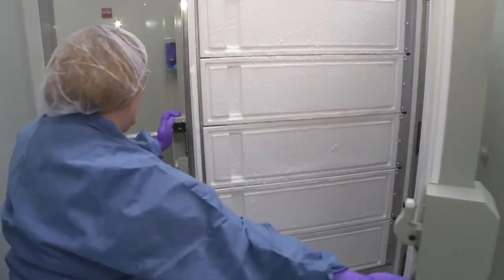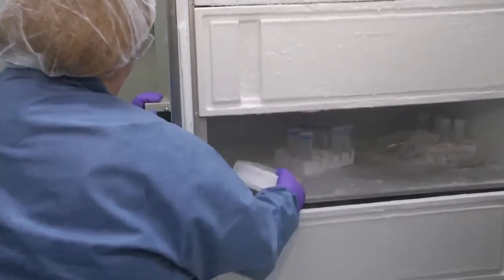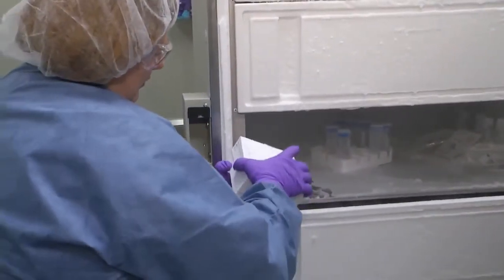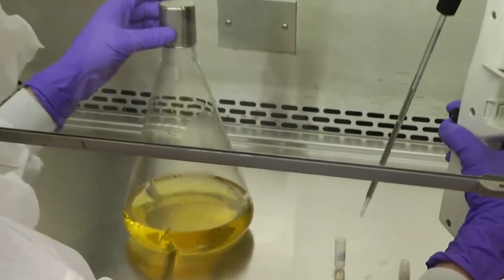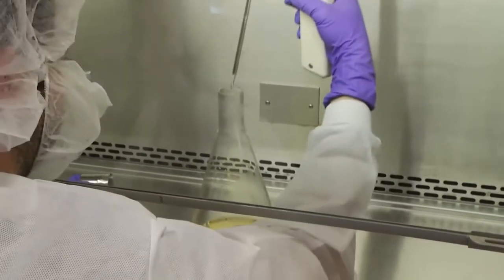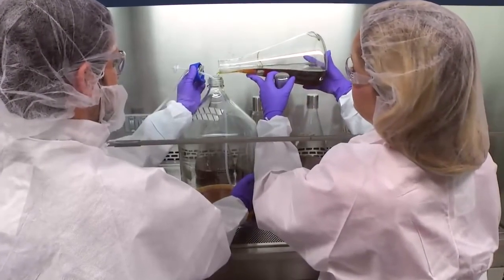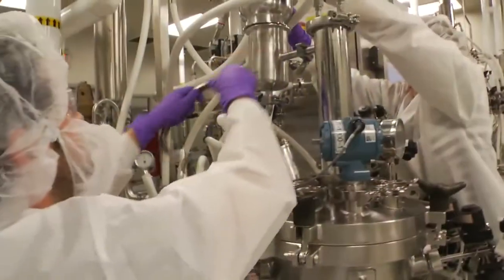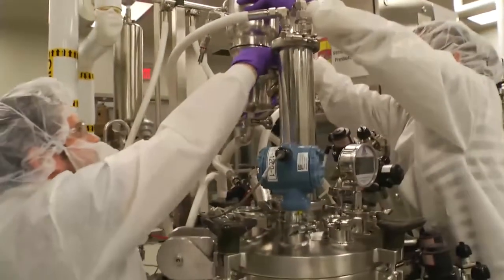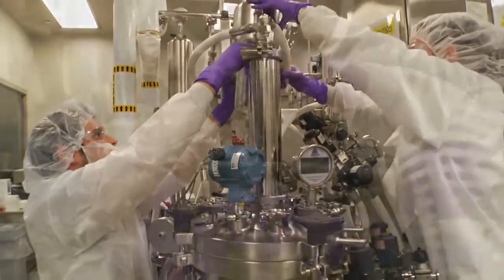The GFP fermentation process really begins with the expansion of our bacteria seed stock. After removing the specially modified E. coli from the freezer and thawing it, it's used to inoculate a small amount of fresh media in a shaker flask. After the number of cells has reached the target amount, the thriving cells are ready for fermentation. Meanwhile, in the fermentation area, operators begin with a complete check of all critical equipment.